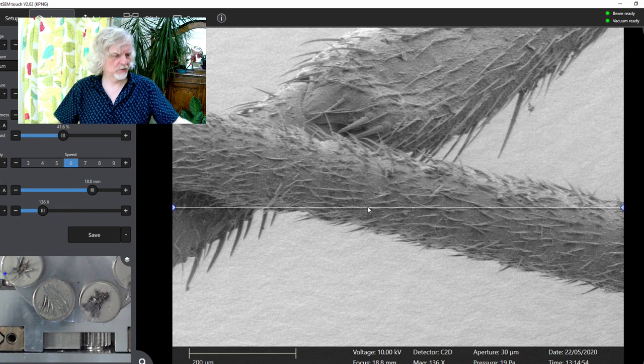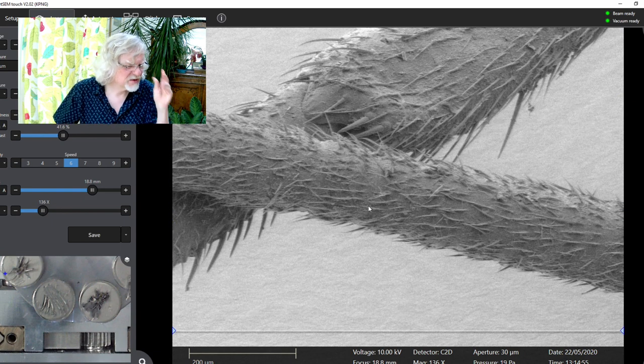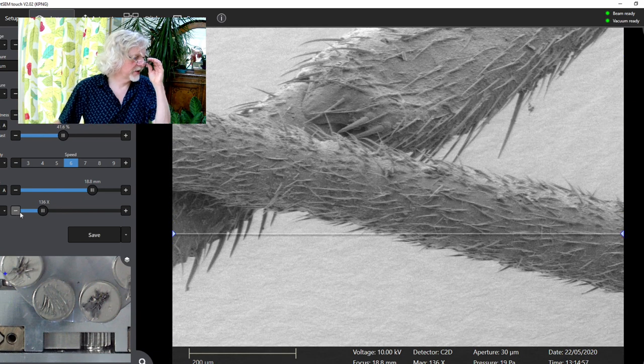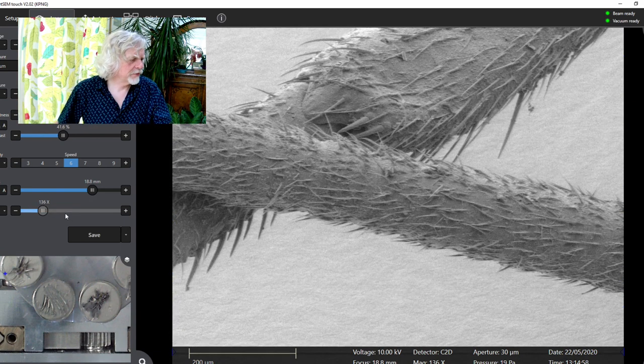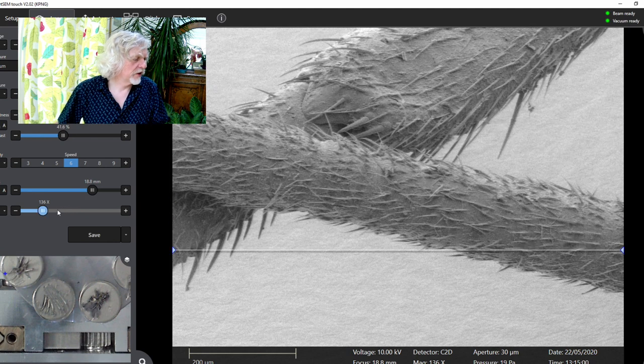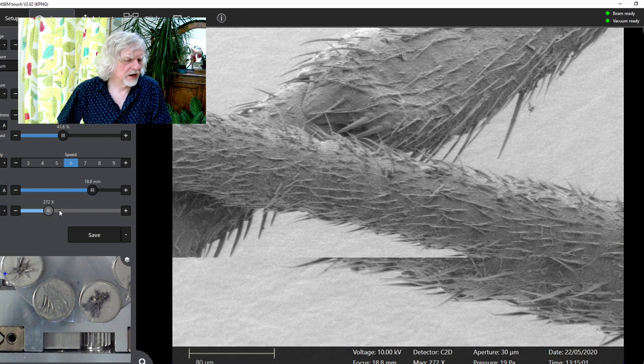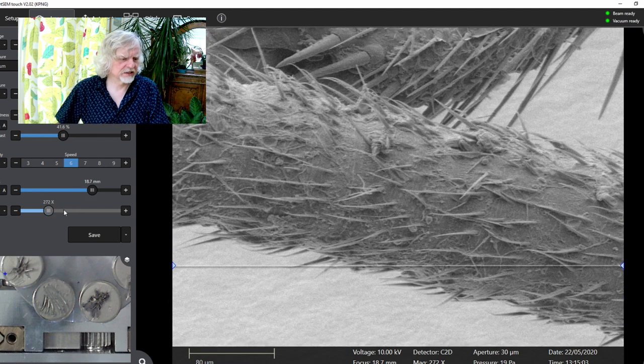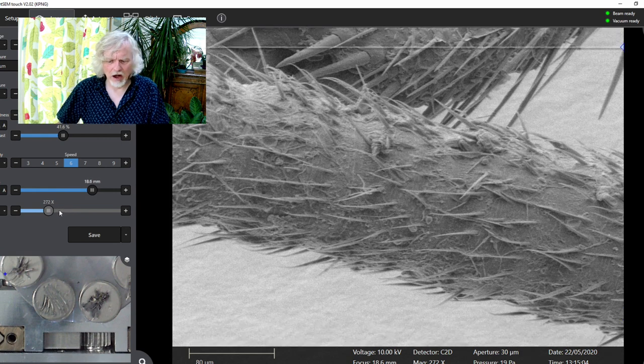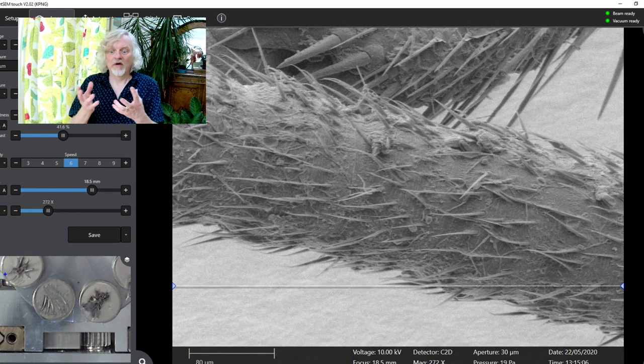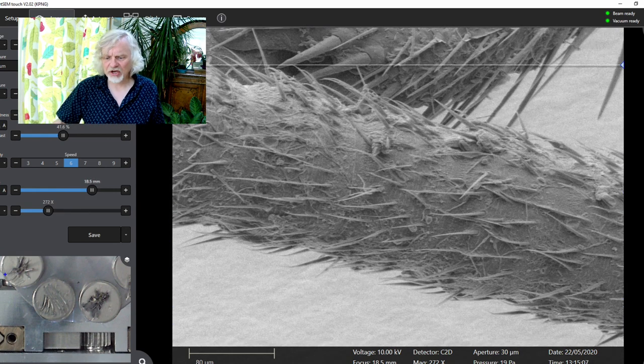And actually, I'm going to put my glasses on here, because then I can really look at this and see how we're going. We'll keep going in. We'll go in a bit further. Because this thing has fantastic powers of magnification.